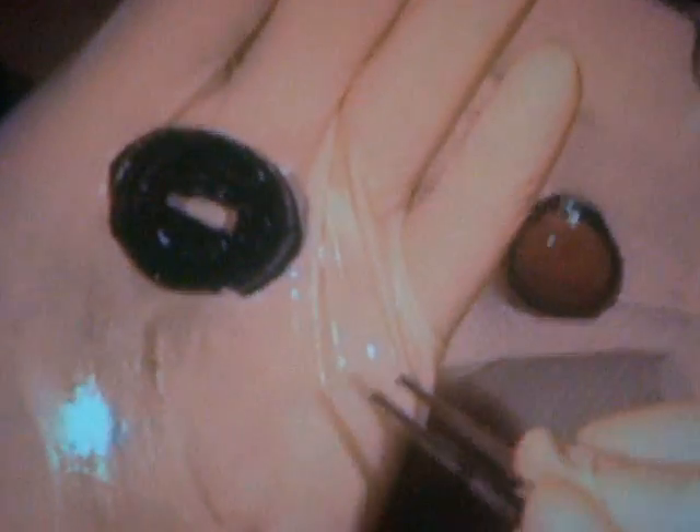That hole in the middle is the pupil — the light opening for the eye. In bright light or sunlight, the pupil shrinks, allowing less light in. In darkness or dim light, the pupil becomes much bigger, letting all available light into the eye. The size of the pupil is controlled by the iris.